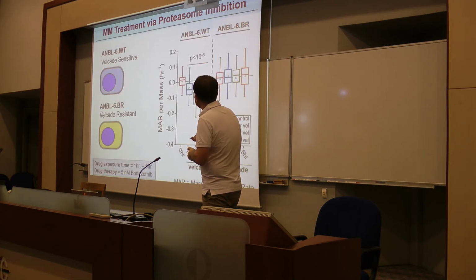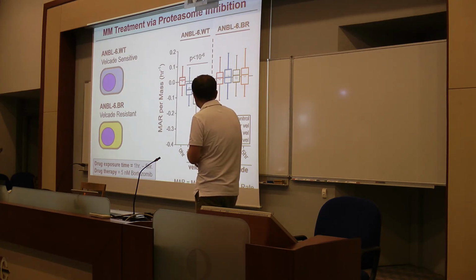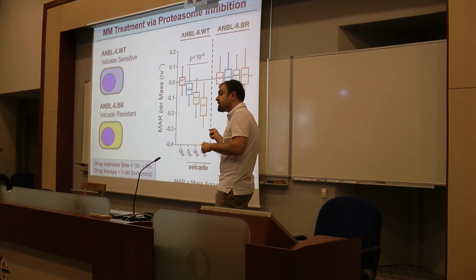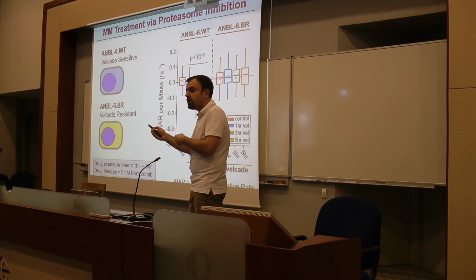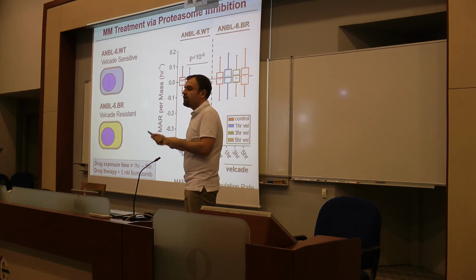We apply this to different cancer cells here. I'm showing you again this MAR with a different profile. This is much easier to see. If you increase the incubation time with the drug, more cells start to die, and you determine this response in just a couple of hours. But in the classical way, this type of phenomenon is usually determined after 3-4 months of treatment. So the doctor gives the patients the drug and then lets them go, and then 2-3 months later they do blood tests.